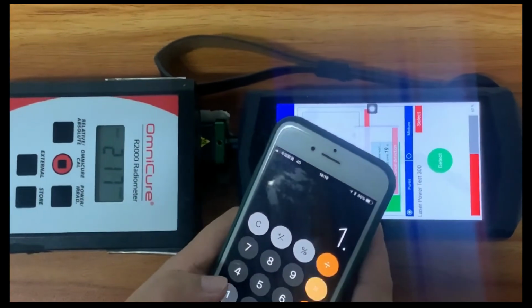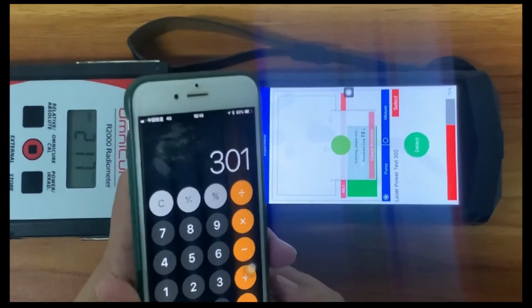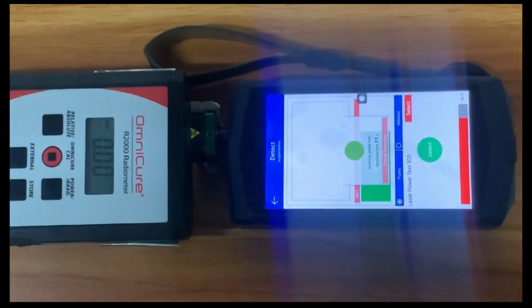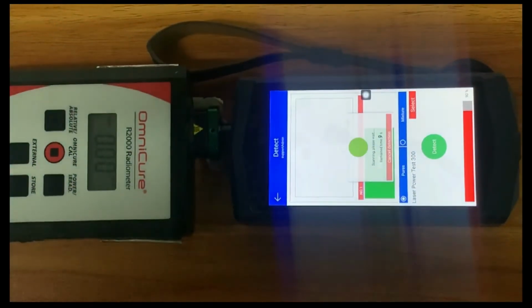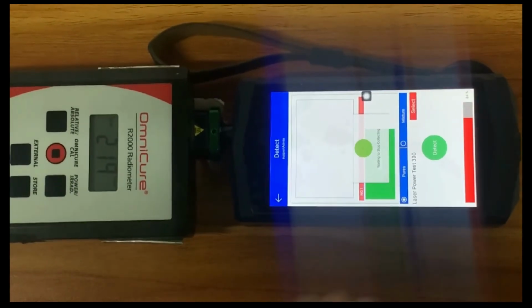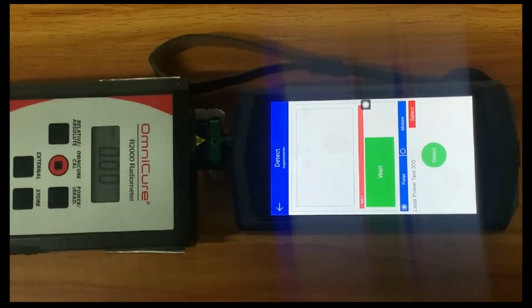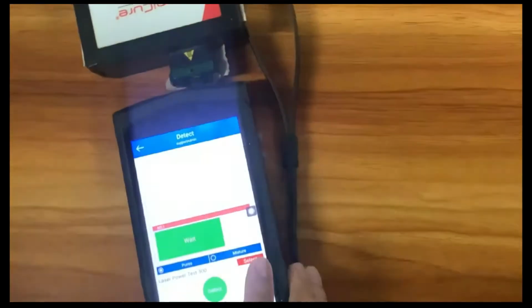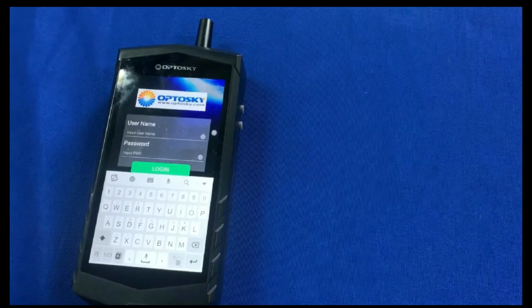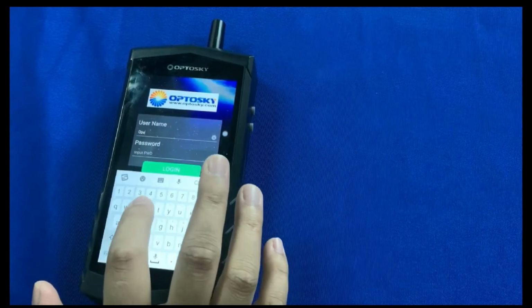And the laser power is accurate. Now, we can complete the test file laser power test. If your power meter is accurate enough, you don't need to transfer with the 1.4%. We are going to perform the test 6 validation test.